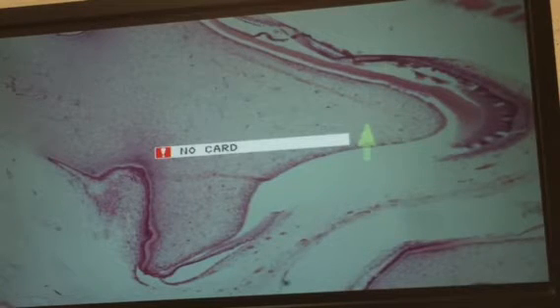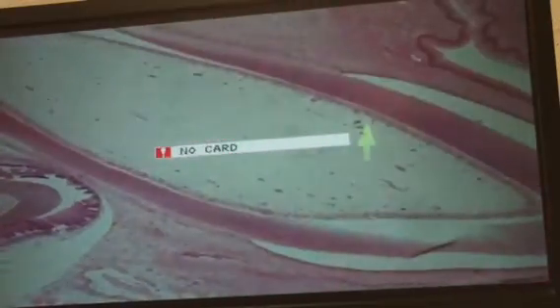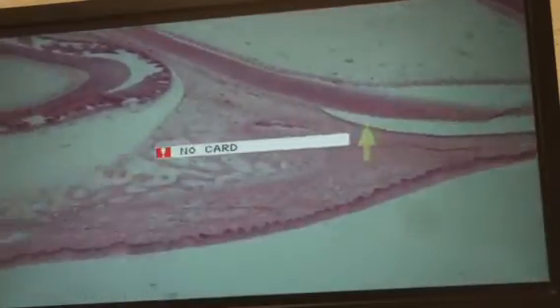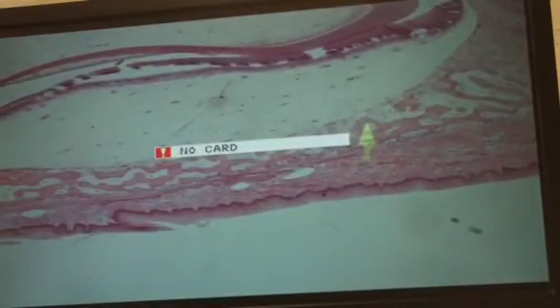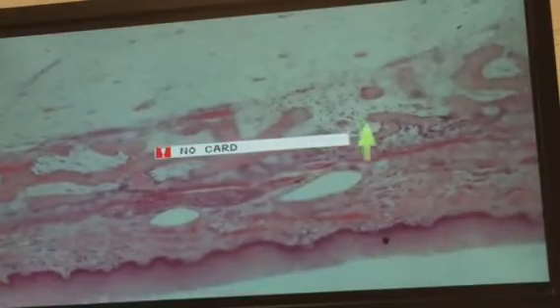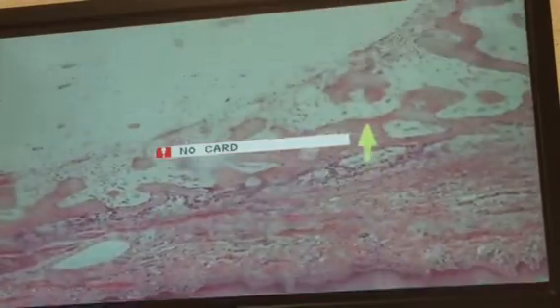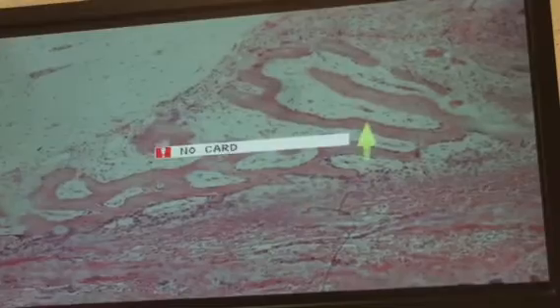These teeth are becoming crowded, so you're seeing the tooth from an adjacent alveolus over on this other side. So you're just getting a portion of that. This is the tooth that is going to erupt and replace this tooth. Well, the things to look for on this slide, this is going back even to next or last semester. Look for osteoblasts and look for osteoclasts. And you'll find that on this slide as well.